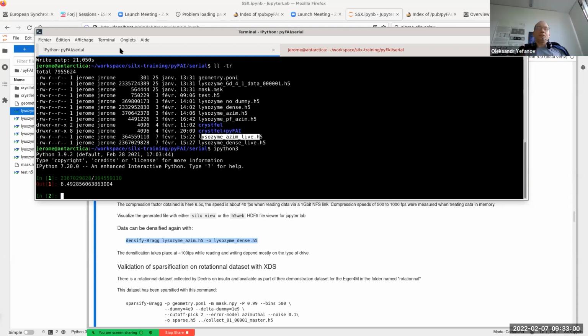Yeah, but that's perfectly fine. Just be careful, because what I've observed is that Jungfrau detectors have a Z offset of panels which is of the order of hundreds of microns, which is quite important already for this size. It's huge. This sounds huge. Well, with your mask, it might be possible to locate the Z offset. So just take this into account. That's something that was not foreseen, but we also didn't expect it. I just measured, and it happens. That's real life. Thank you very much.